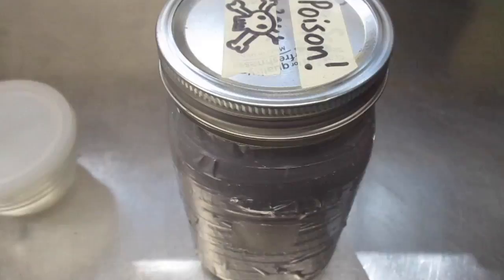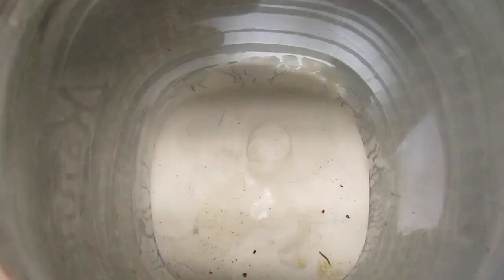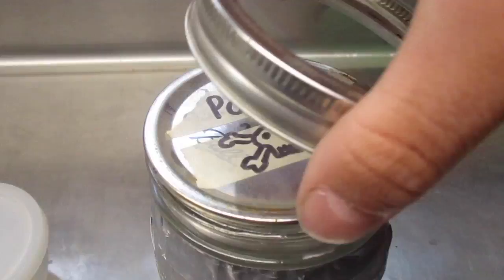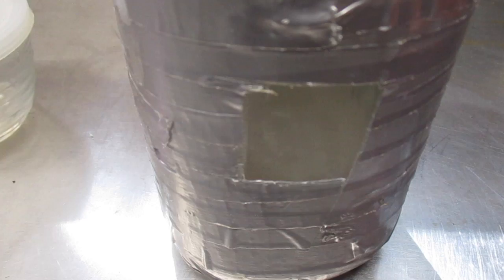The other method uses a bigger jar — it's essentially like fumigating them. At the bottom of this container is just plaster of Paris, and soaked into the plaster of Paris is 100% acetone. The fumes from that will essentially just kill your insects.